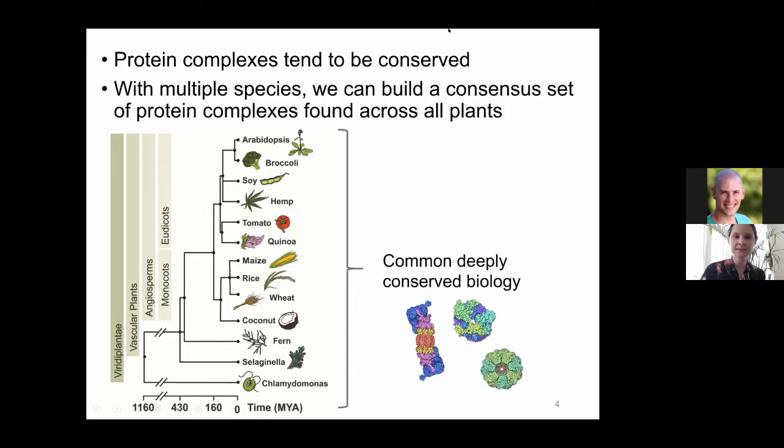Okay, so the technique I'm using is protein complex discovery by cofractionation mass spectrometry, or protein correlation profiling, which you've already heard a few talks about today. The idea is that in a cell lysate, where we've disrupted the membranes and soluble proteins are floating around, proteins that are in a complex together will travel through a column and drip out of the column at the same point across this 96-well plate.